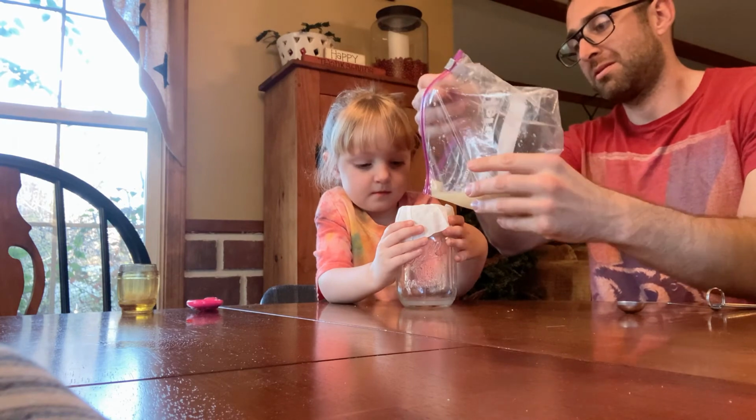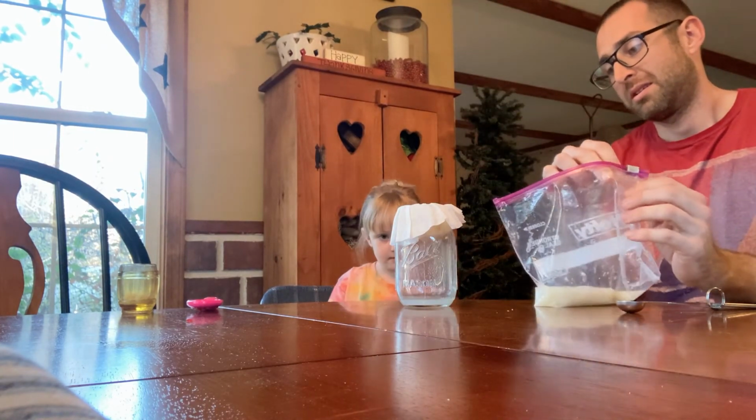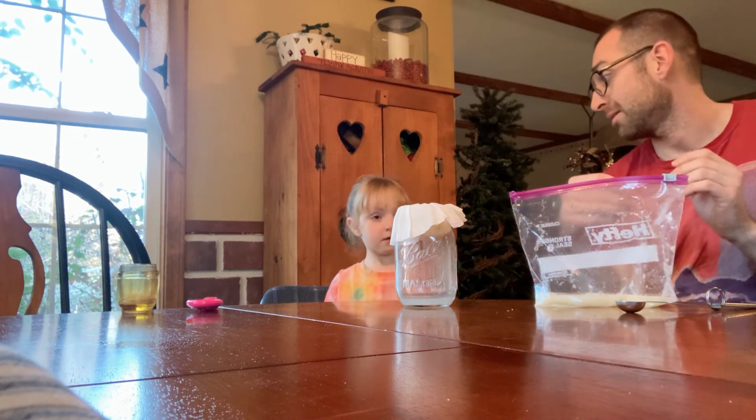Like a little flower or something. Okay, you can let go. But we're going to wait a little bit for all the water to drip down, because that's what we want. So we might have to wait a couple minutes, so I'm going to pause this video, all right?